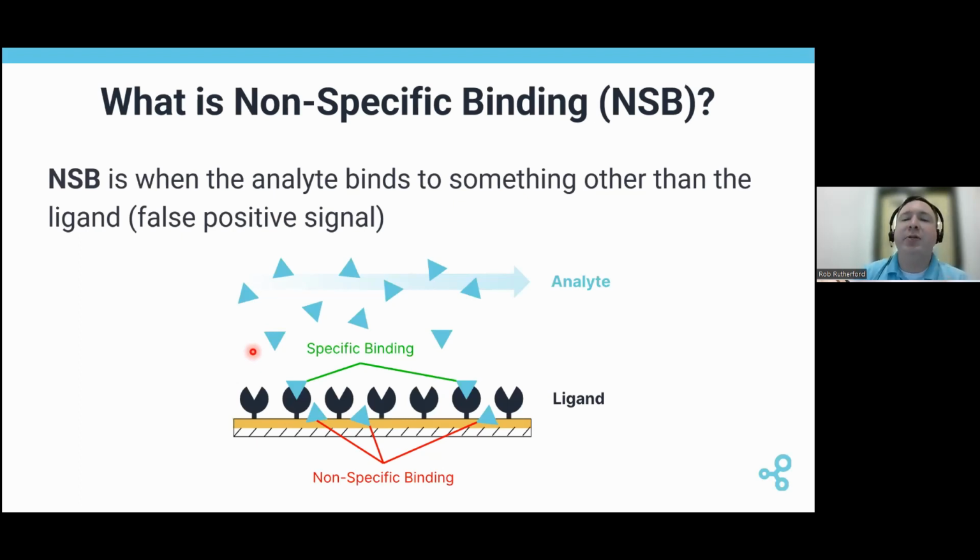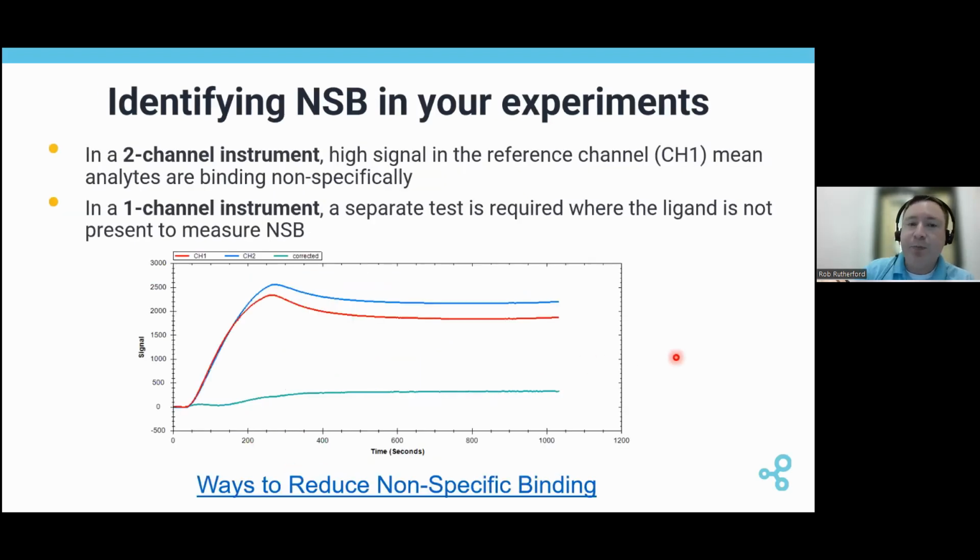It's not always going to be this exact one, so fix that and you're good to go. But what we need to understand is that it's basically an interaction between the sensor itself and the analyte. It's not due to binding between the ligand and the analyte itself.